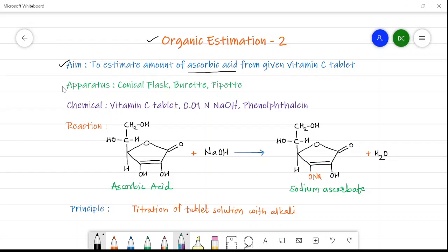For this estimation we require apparatus such as a conical flask, burette, and pipette, and chemicals like a vitamin C tablet. We can use different vitamin C tablets such as Limcee or Celin. Along with this we require 0.01 normal sodium hydroxide and phenolphthalein as an indicator.